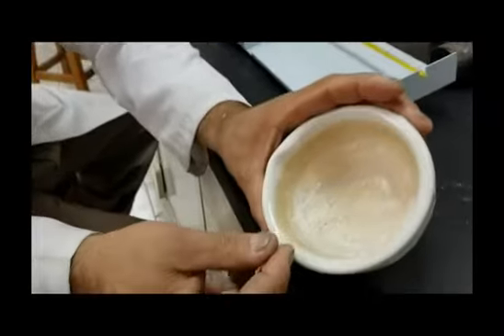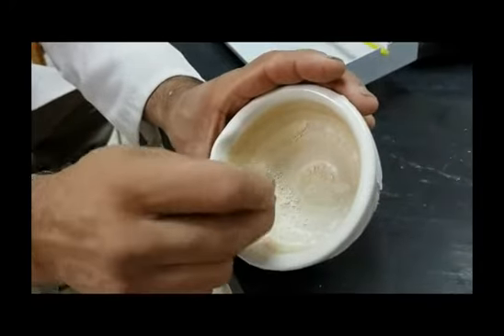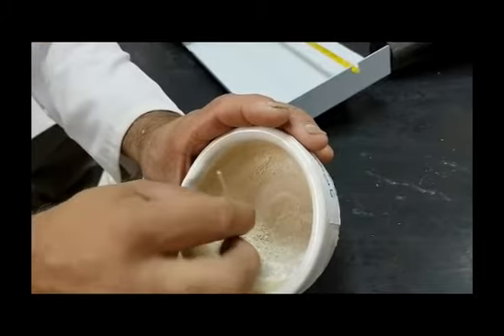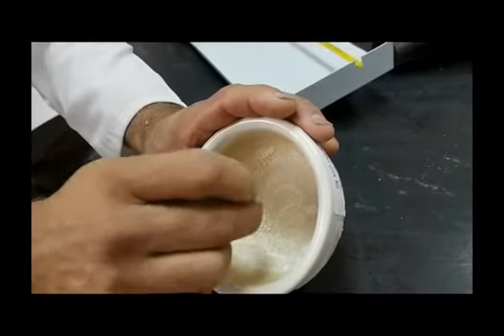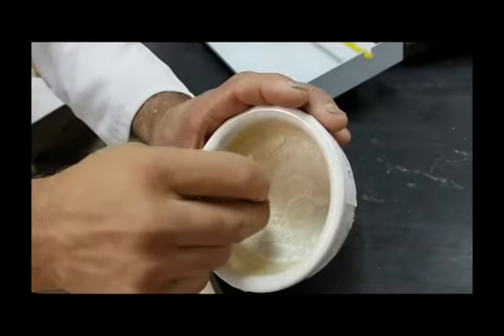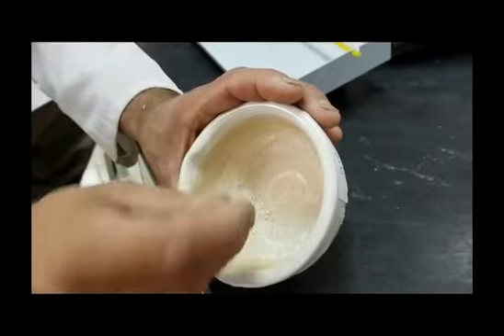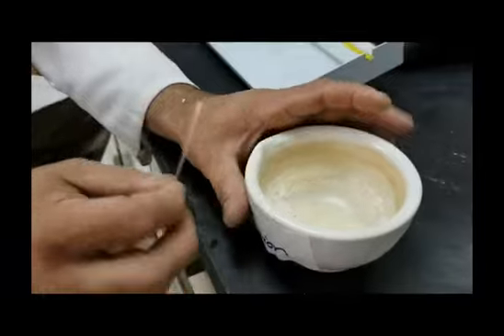Melting point measurement will be done using the same procedure you used during your previous courses, including the pharmaceutical organic chemistry course. The capillary tube should be first filled with not more than half a centimeter of the tested powder. Remember to tap it to the closed end.